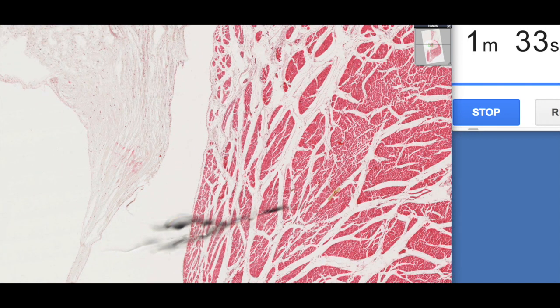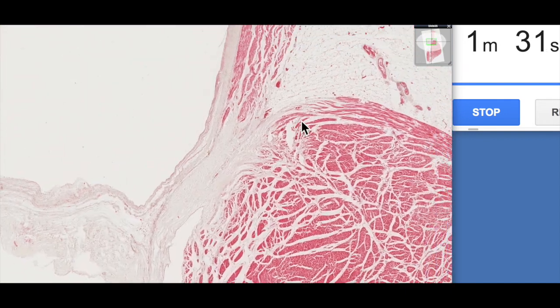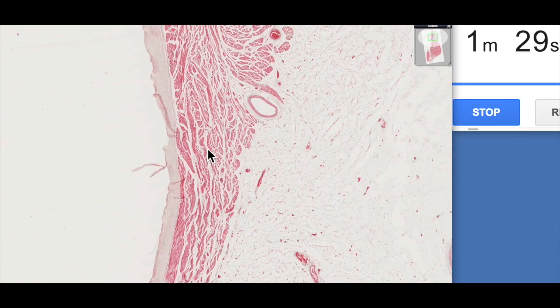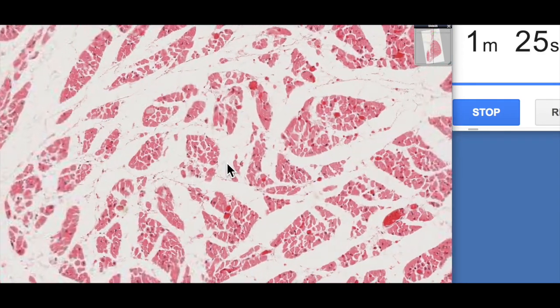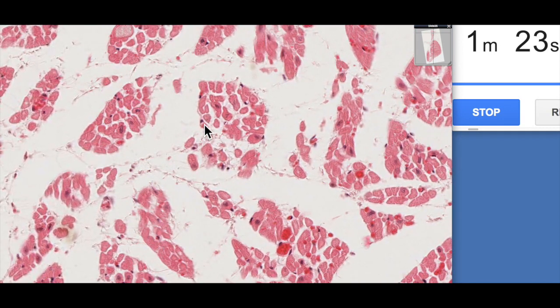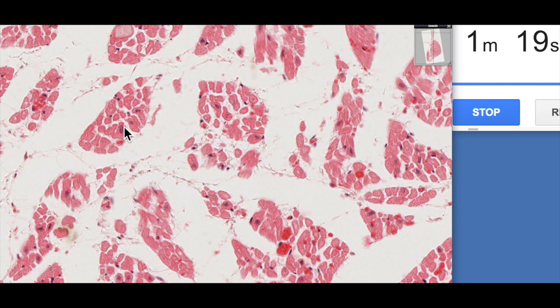So if we sort of zoom back out here, here we have the myocardium. If we have a quick look at the myocytes here, the cardiomyocytes and we can see them in cross section here, centrally located nuclei and we can see the cardiomyocytes are relatively small.